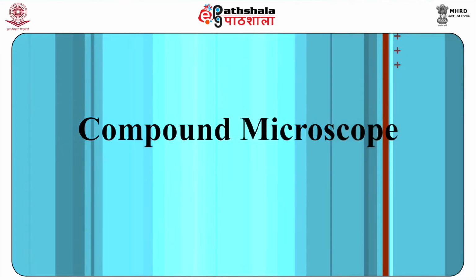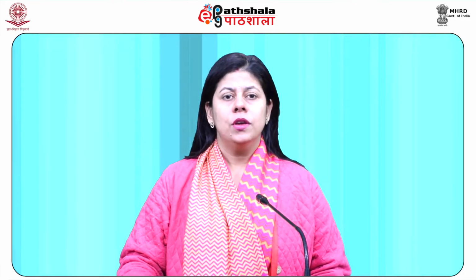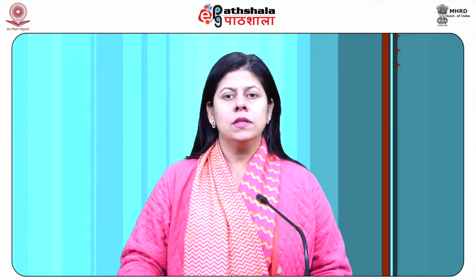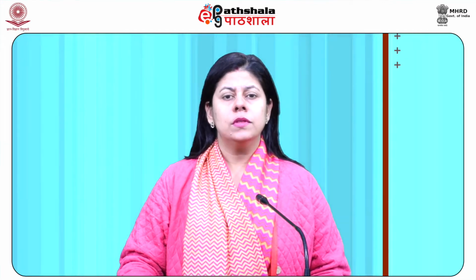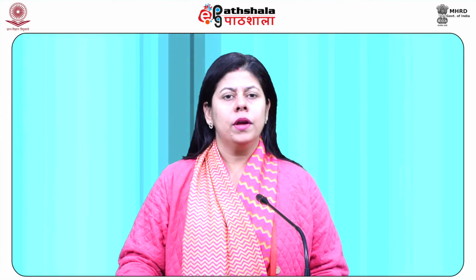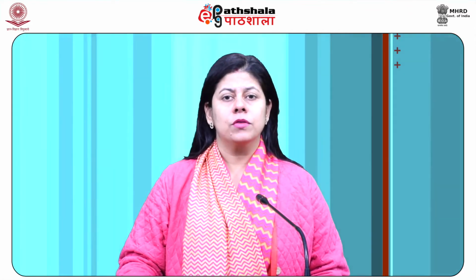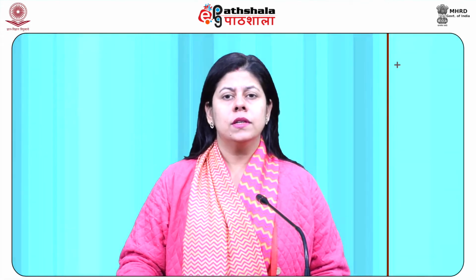Compound microscope. It is a type of microscope which utilizes multiple lenses in order to collect the light from the sample and then to focus the light into the eye. Separate sets of lenses are used. These microscopes are heavier, larger and more expensive as compared to simple microscopes because of the increase in the number of lenses used in construction.